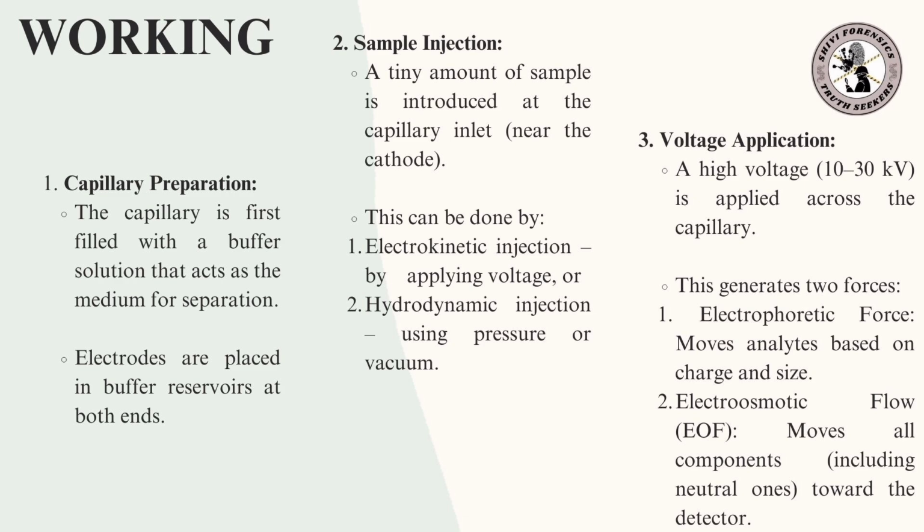Third is voltage application. We apply a high amount of voltage across the capillary. We generate two forces. First, the electrophoretic force, which moves analytes based on charge and size. A small size particle will move faster, and a large size particle will move slower. Second is electroosmotic flow. It moves all components towards the detector.